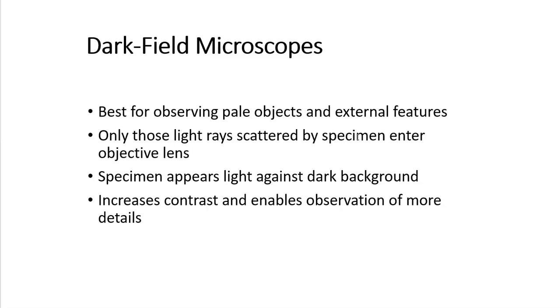So we can see flagella, we can see motility, we can see fimbriae, we already talked about that. So we can see these external features. It's really good for the external features because they're being lit, all right? And you only get the light rays that are scattered by the specimen entering. The specimen appears on a dark background, okay, and it increases the contrast.